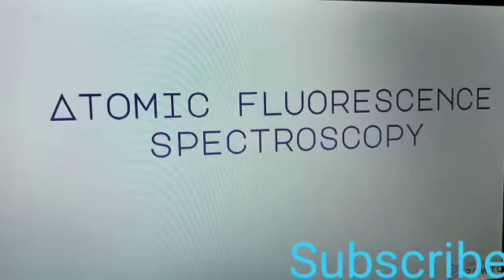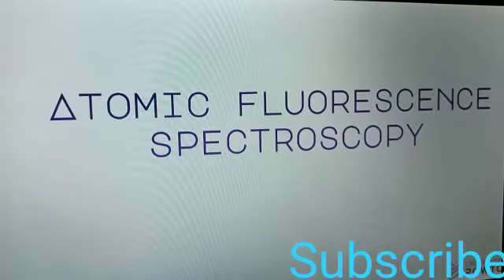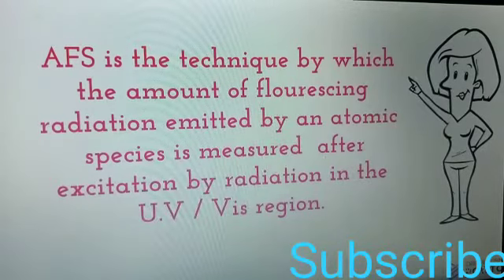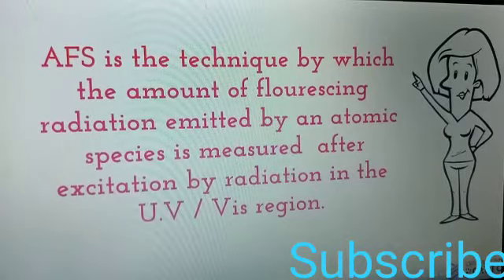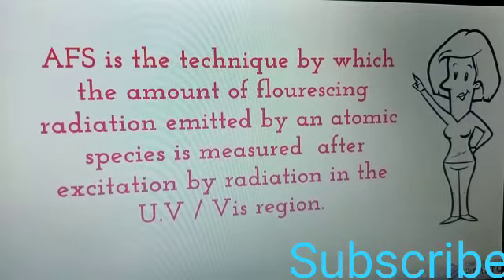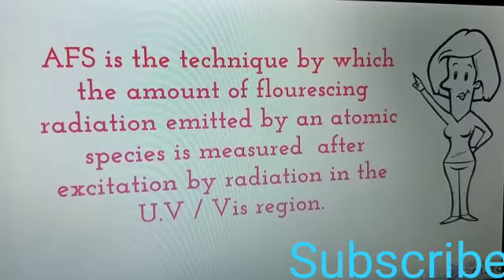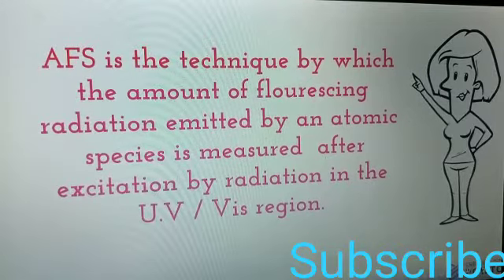What is atomic fluorescence spectroscopy? Atomic fluorescence spectroscopy is the technique by which the amount of fluorescing radiation emitted by an atomic species is measured after excitation by radiation in the UV visible region.